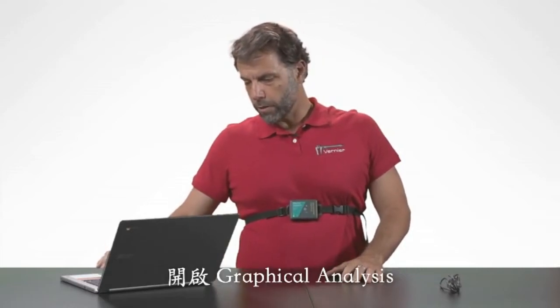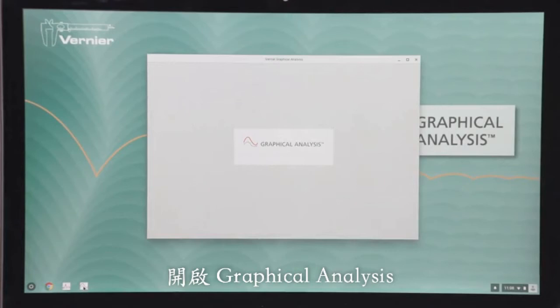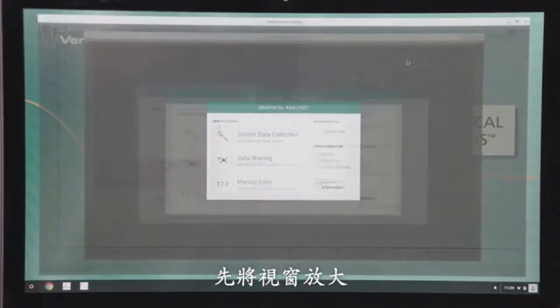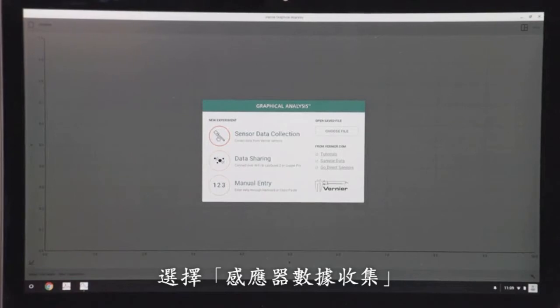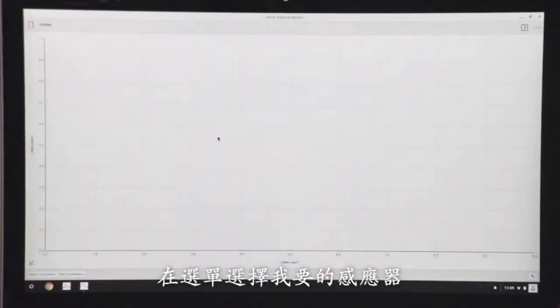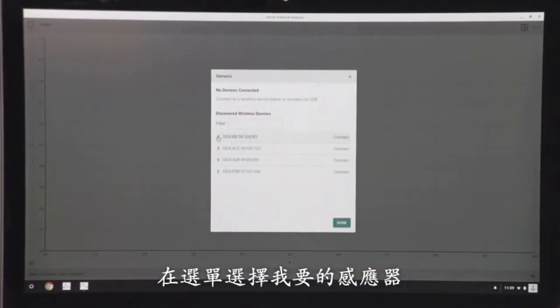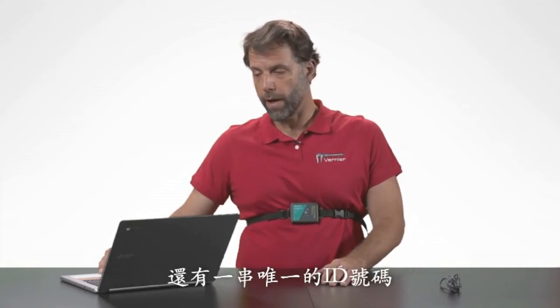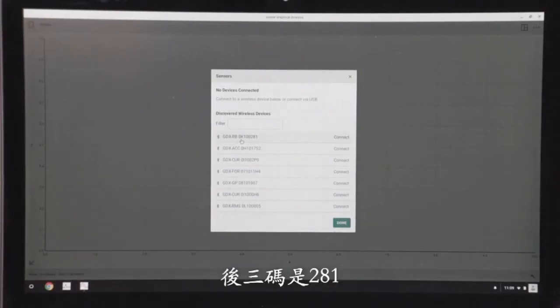I'm going to launch Graphical Analysis, maximize the screen, and select sensor data collection. Then I'm going to select my sensor from a list. It'll have the same order code as the sensor — GDX-RB — and then a series of numbers which are a unique identifier. This one has the last numbers 281 on it, so I'm going to connect to it.